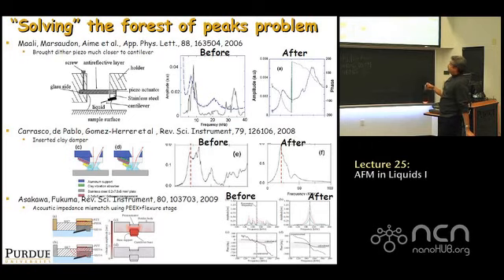The other option is keep the piezo where it is, but all the intervening structures that are there, why not put some sticky damping material or something that damps out the vibrations of all the things in between. And so they put a clay damper to try and damp out the vibrations of all these substructures, and they've improved to some extent the resonance response, right?